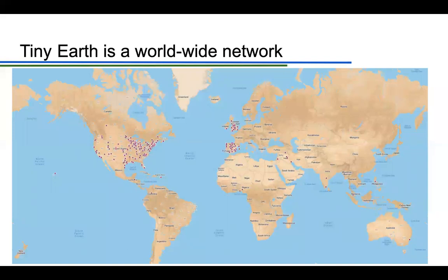The Tiny Earth database was released this summer as a way we can record and share this information. The database is available to all our members around the world as a tool to log things, and it also has a public-facing side that we can share with the rest of the world and the scientific community. It provides a great resource for us.